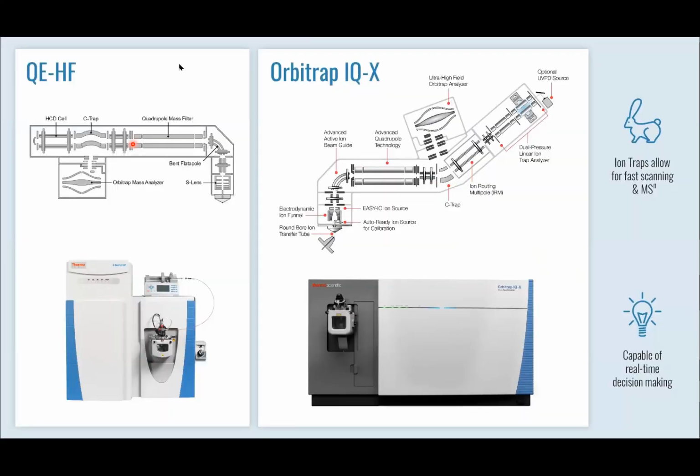Thermo has introduced a new mass spectrometer called the IQX that we've been helping develop. Most of our lipidomics work had been done on a Q-Exactive platform. This platform has a quadrupole mass filter, a collision cell, and an Orbitrap. For all of the analysis, we're doing high resolution, so MS1 and MS2. The Tribrid platform shown over here has the quadrupole mass filter, the collision cell, and the Orbitrap, but it also has these ion traps down here.